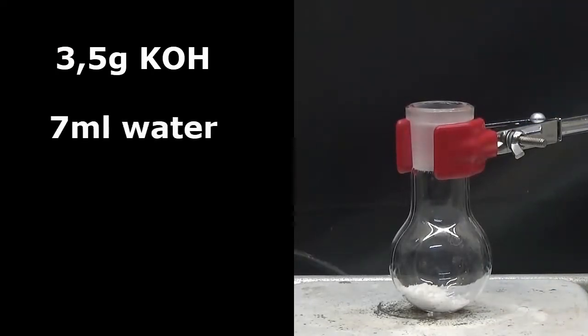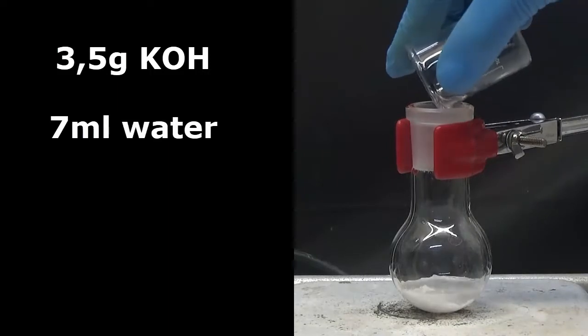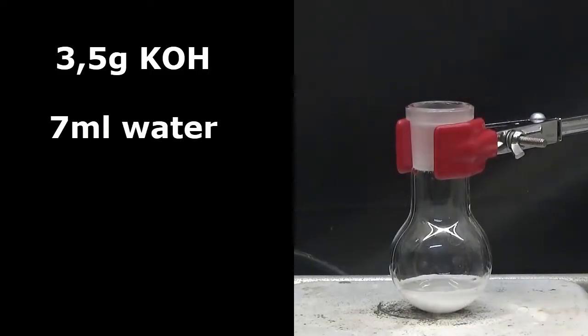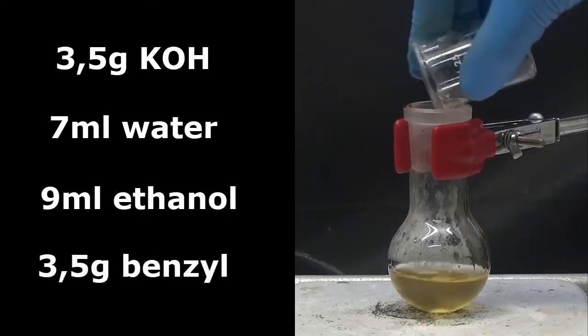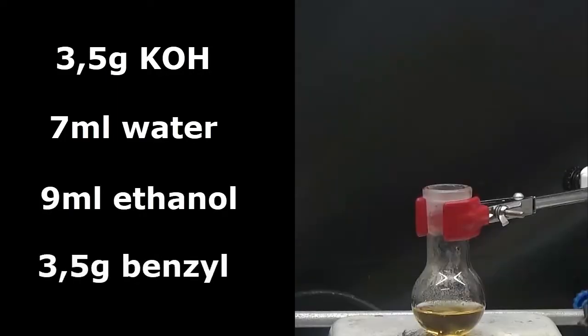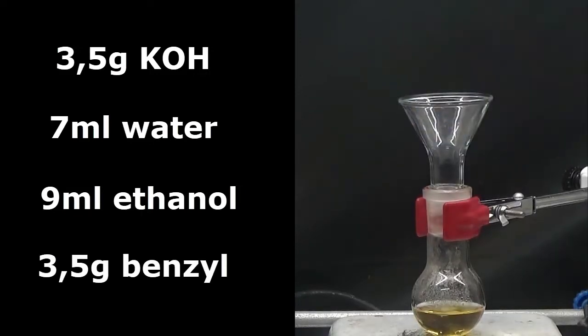...diluted in 7 milliliters of water in a 100 milliliter flask, heated if necessary to promote dissolution. 9 milliliters of ethanol and 3.5 grams of benzyl are added to this solution and heated in reflux for 30 minutes.